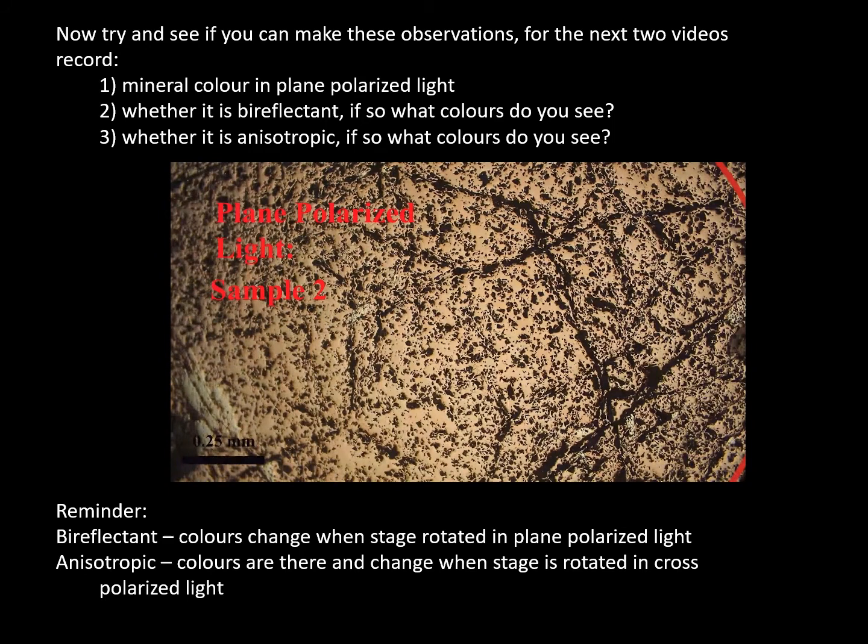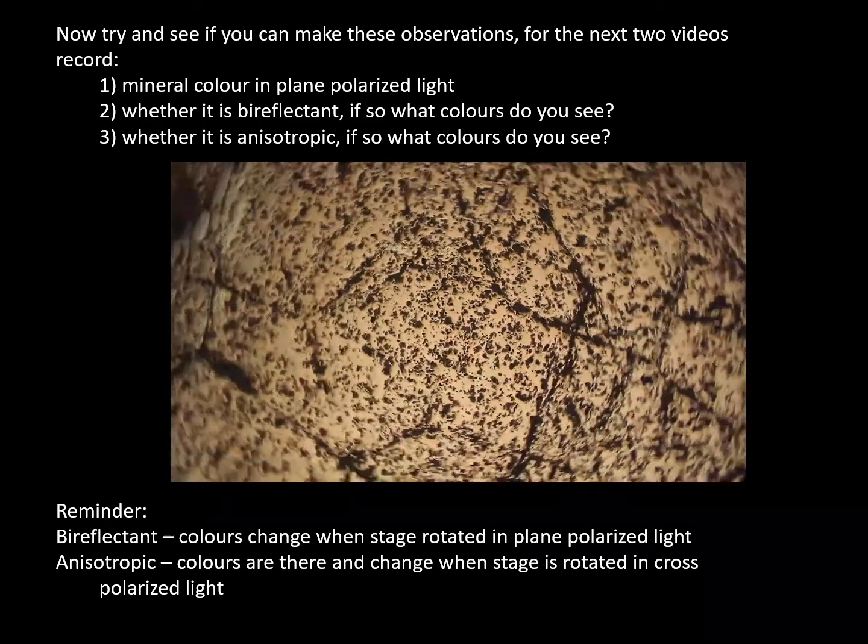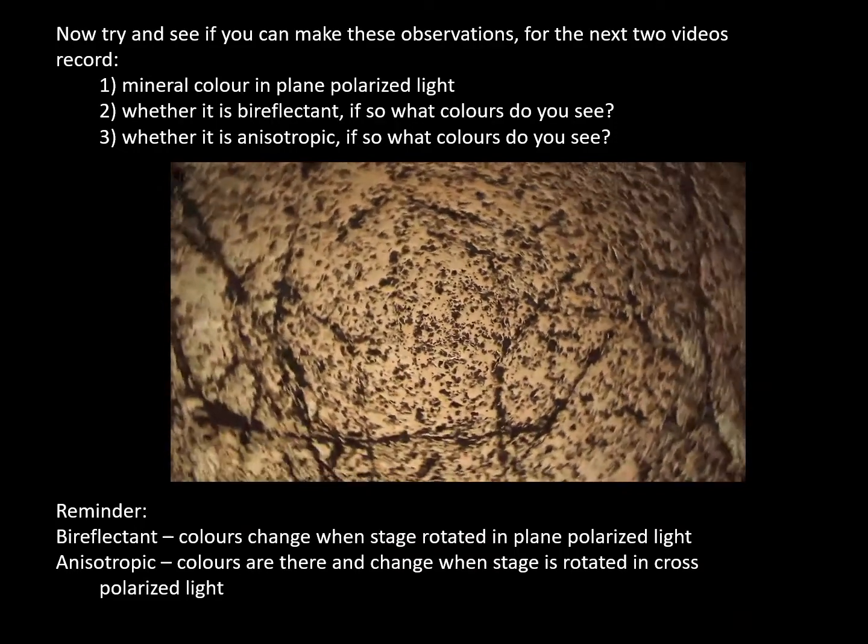All right, now here's our second sample, and we're going to do the same. Again, we want the mineral color, whether it's bireflectant, so what colors do we see, whether it's anisotropic, and if so, what colors do you see?